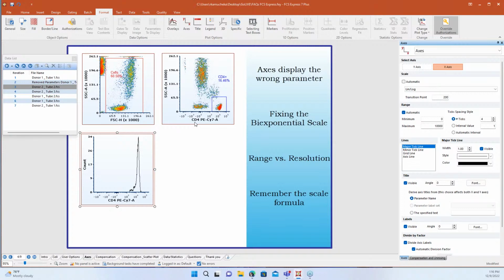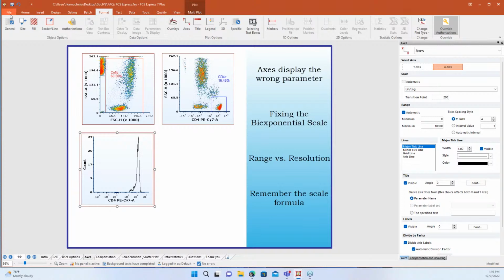So what this does when it remembers the scaling for us, it will apply it to this parameter throughout my entire layout. Sometimes that's great, and it's fine because this new scaling works just as fine in these other plots as it does in the original plot where I changed it. Sometimes it's not, and I've gotten a customer support ticket just recently where they're like, all right, so I changed the scaling on one plot, and then suddenly my other plot, I can't even find my populations from, and what happened? So this new feature that I'm talking about, remember the scale formula, there's two places you can find it.